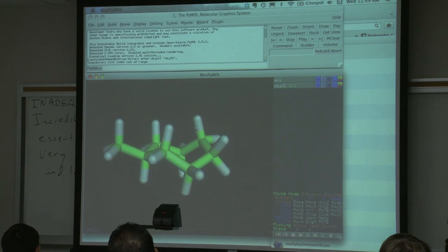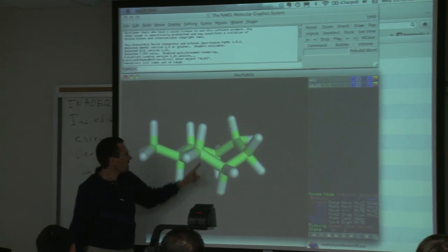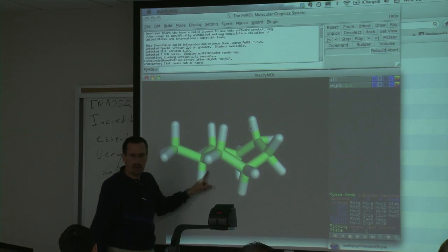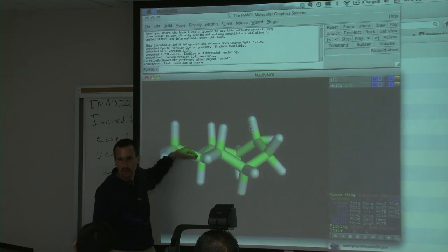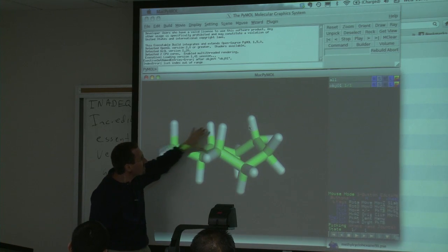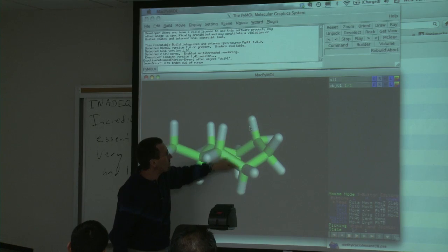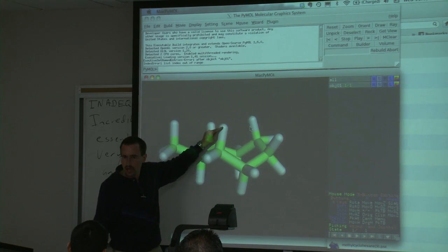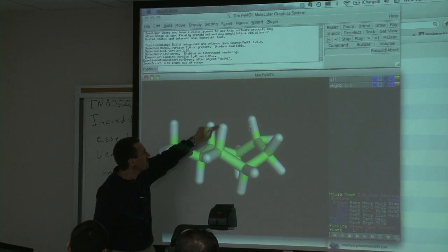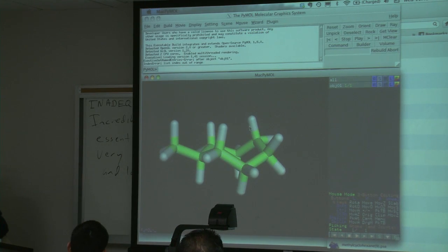You notice you have 3 hydrogens that are basically axial on each face. I've put the methyl group equatorial here on the ring. And so you can start to see that all those things I was thinking about, like a big J between these hydrogens, or a close contact between these hydrogens, are going to apply.